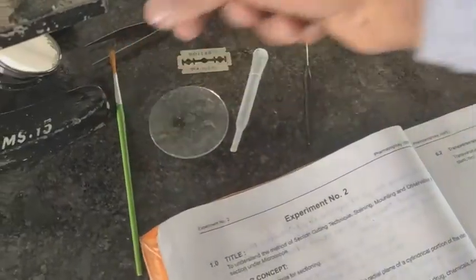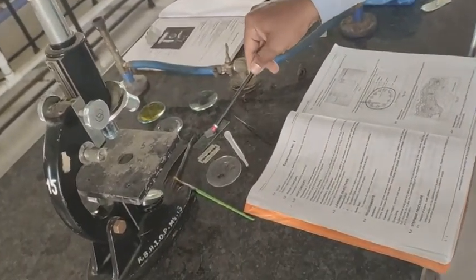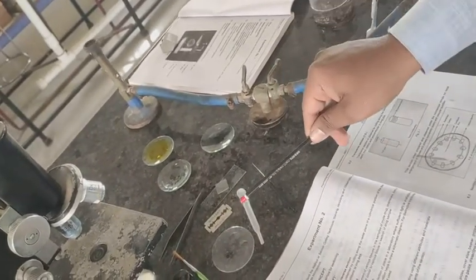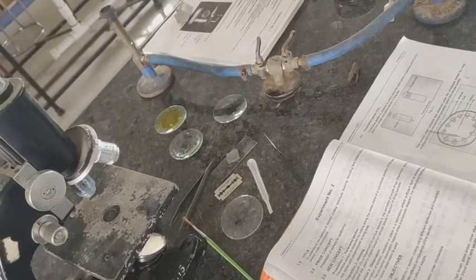You can see these important things: your microscope, then your brush, then forceps, slide, cover slip, sharp razor, then watch glass, then your dropper, forceps. These are the important things for your section cutting.